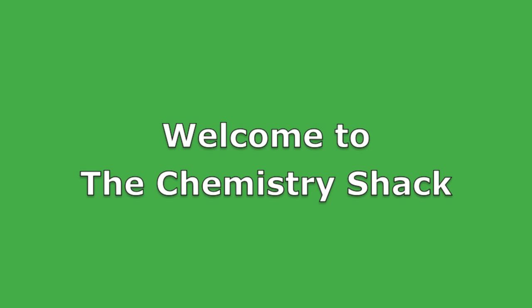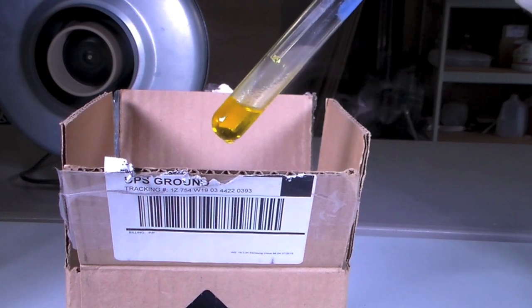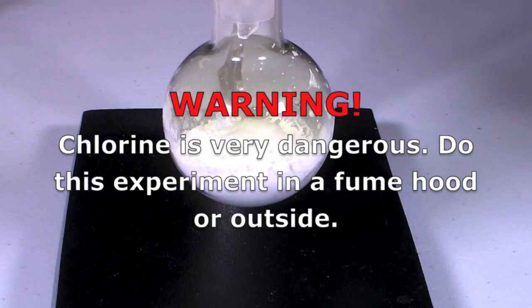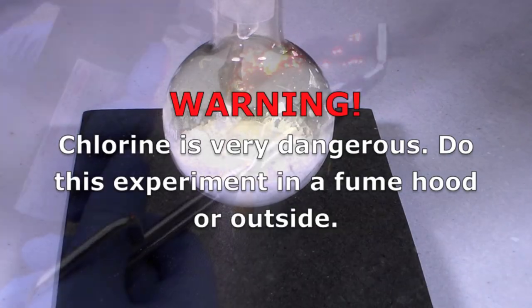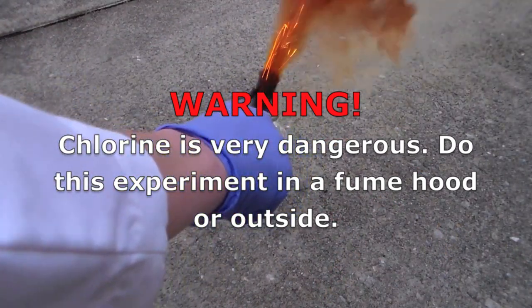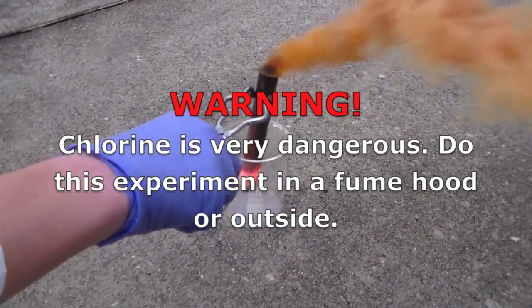Hey guys, and welcome to the Chemistry Shack. In this video, I'll be making liquid chlorine and reacting it with a few things. But first I'll start with a warning: chlorine gas is obviously very dangerous, so do this experiment either in a fume hood or outside with a respirator.